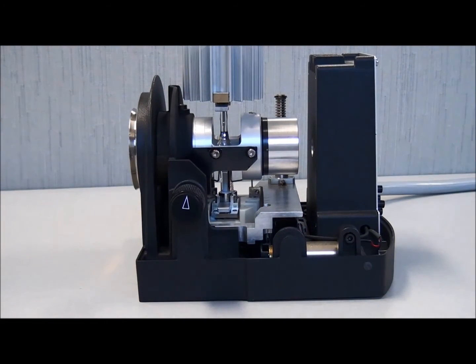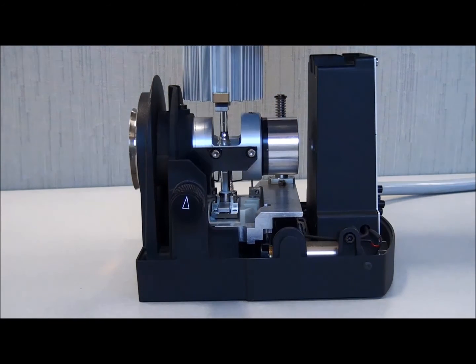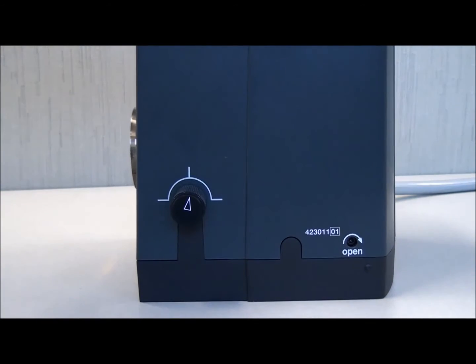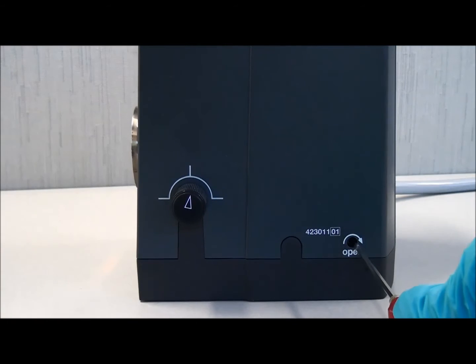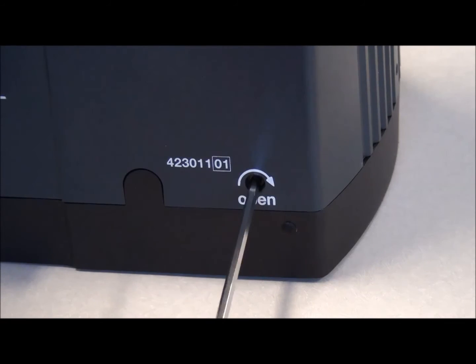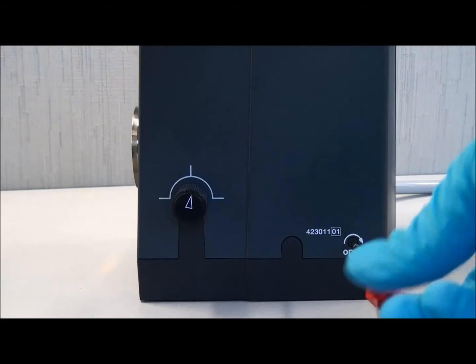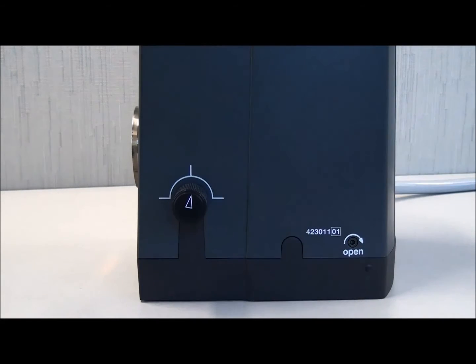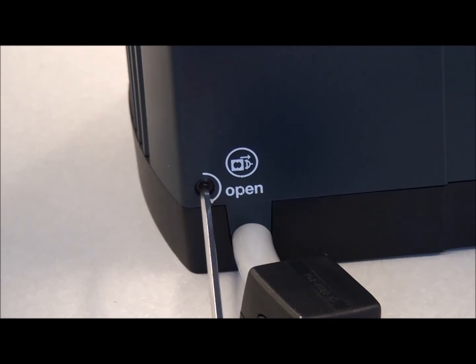You can now replace the lamp housing cover. Carefully slide this cover straight down and tighten the two 3mm screws, one on each side. Turn these screws fully until they stop.